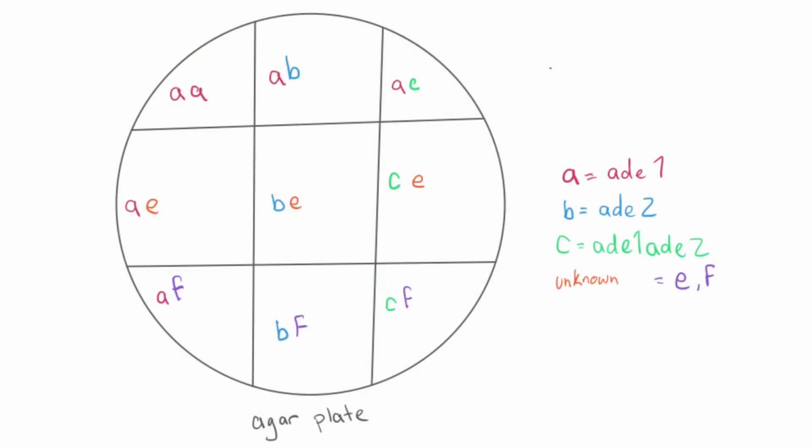To start off the experiment, I labeled my agar plate as shown above, to prevent confusion and keep each yeast mix in order, and to make the observation of each yeast easier.